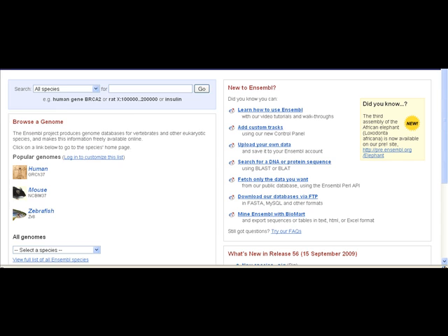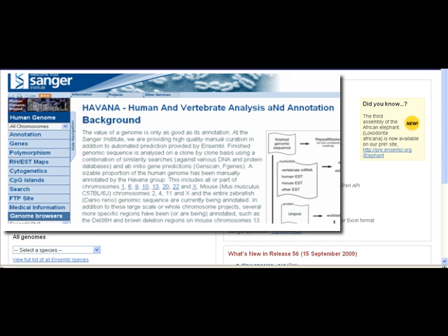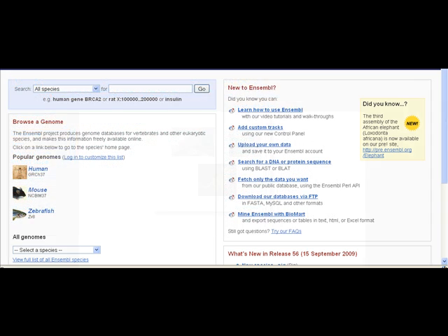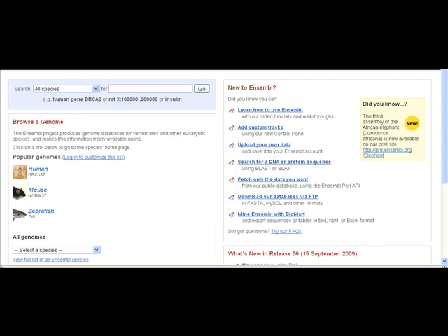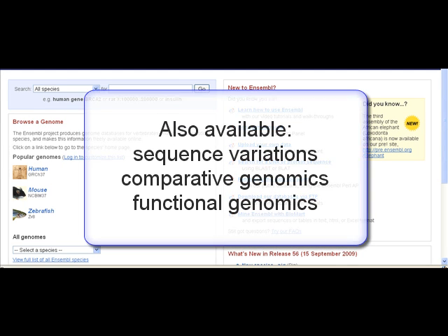For some species, such as human, Ensembl includes manually curated transcripts from the Vega-Havana project at the Wellcome Trust Sanger Institute. Ensembl provides gene sets for even newly sequenced, low-coverage genomes such as cat, elephant, and dolphin. Other annotation includes variation mapping, comparative genomic studies, and functional genomics.